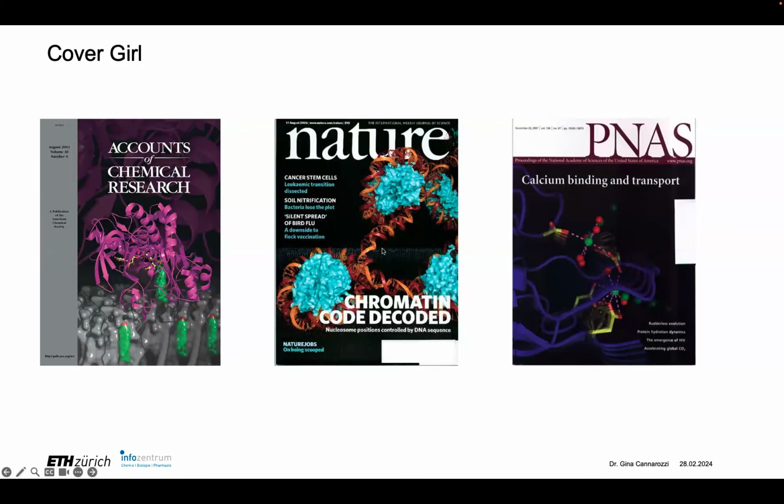In this picture, you see DNA. The DNA is visualized as red and orange ribbons, and you see it's wrapped around histones, and the histones are here a blue surface. And here we've zoomed in on the active site. And the thing that this picture adds is that you have bonds drawn. The dark purple is the protein, and you see a side chain here, which is interacting with the ligand. So you can measure the distance here. I could display this as a number, how many angstroms that is, or here they've chosen just to draw it as a dashed line. So these are some of the things that are possible.